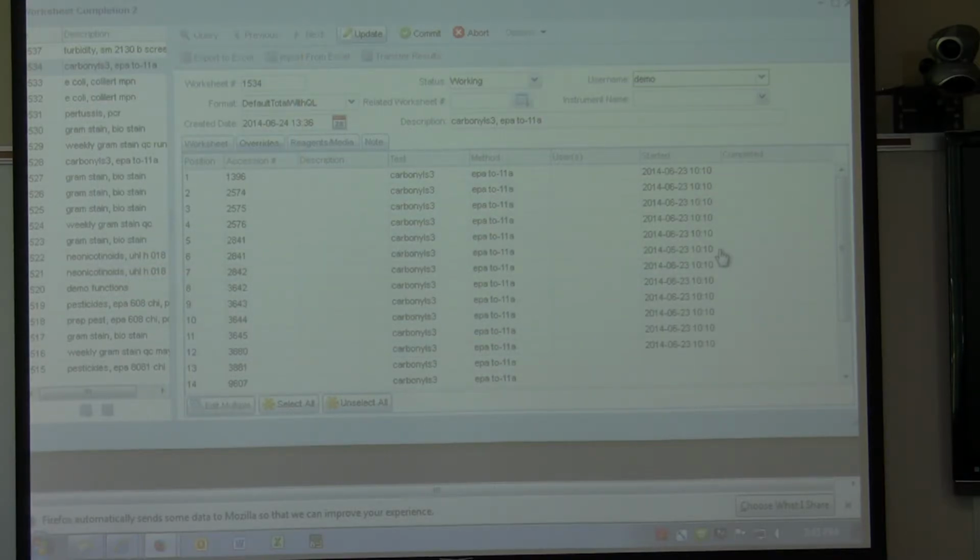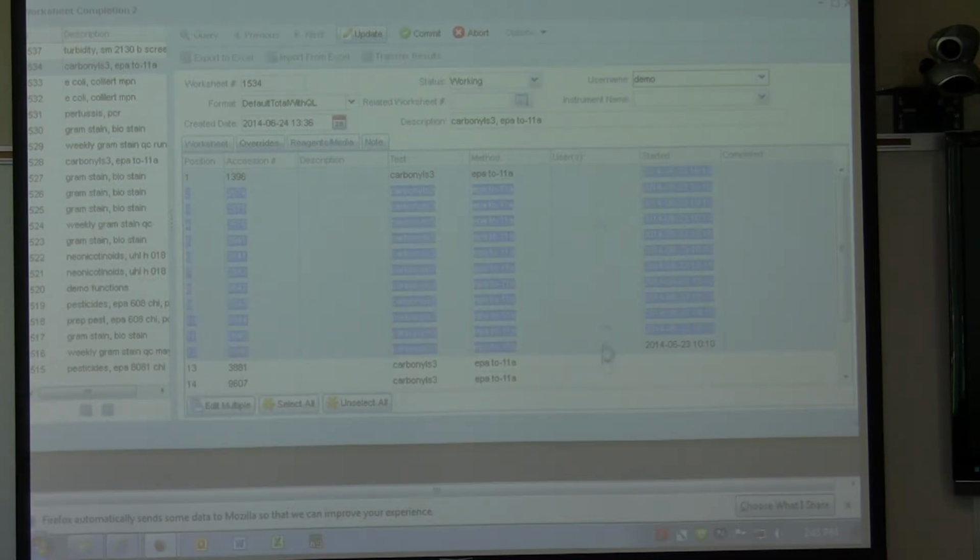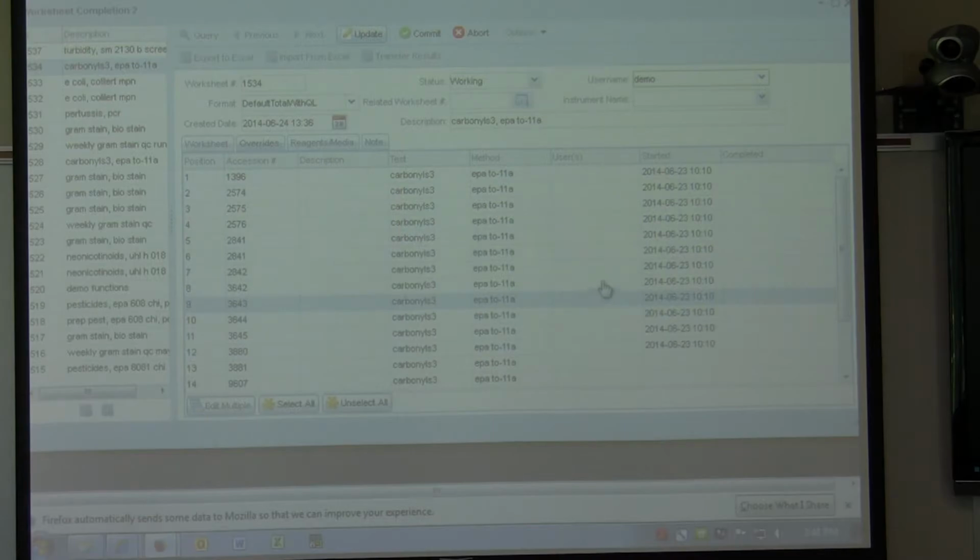There you go. So why wouldn't edit multiple work when you had just that line? It will. Obviously you're on one line. I was just picking the group for that. But yeah, if you pick multiple lines, you can do that at multiple.